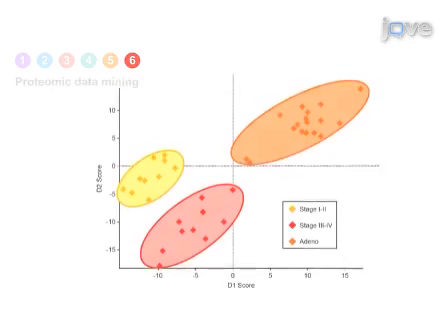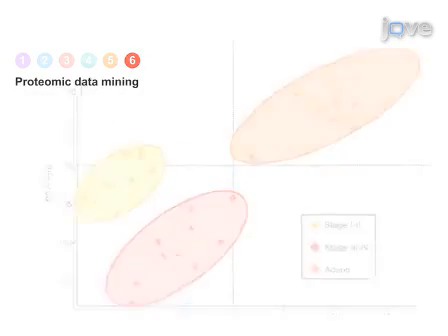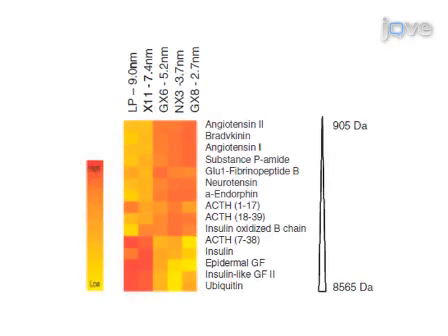The final step is to utilize professional software to perform data analysis. Ultimately, the mass spectra and statistical analysis results reveal the specificity and efficacy of low molecular weight proteome harvesting.